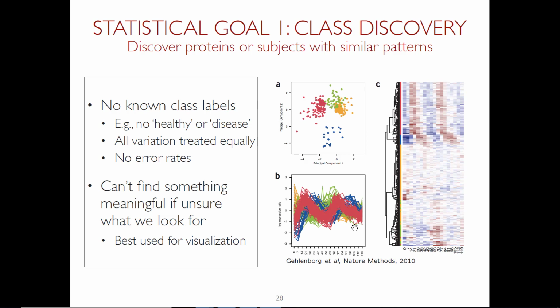So this is really great for data visualization. This is certainly great for QC. One way I like to use principal component analysis is to look for failed samples. If you have a sample which is compromised, it will stay outside of the bulk of the data. This is a really good way of detecting that.